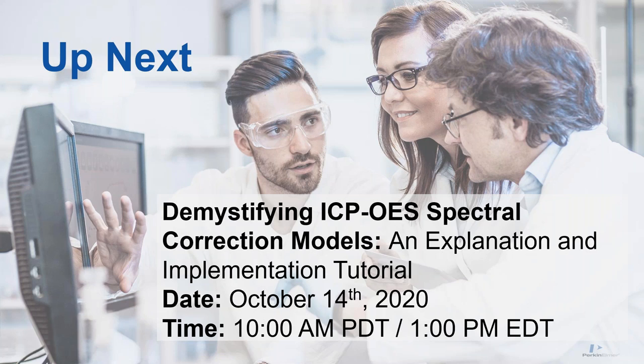Other questions here. Here's a question. I am pipetting internal standards into all my samples. We have a T to pull from both, but I've never gotten it to be consistent. Is there a trick to getting that to work better? If your T is pulling from both, I'm assuming you're pumping into your T, not T's on the other side of the pump.